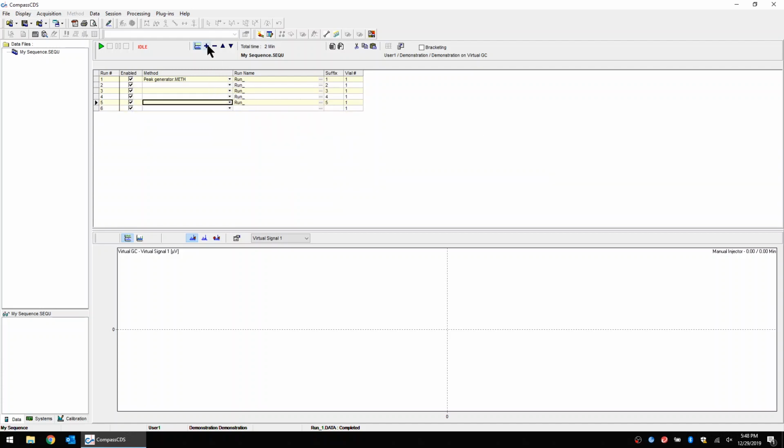Lines can be added, removed, or rearranged. To make setting up sequences easier, lines can be autofilled with the content from the top line of the sequence.